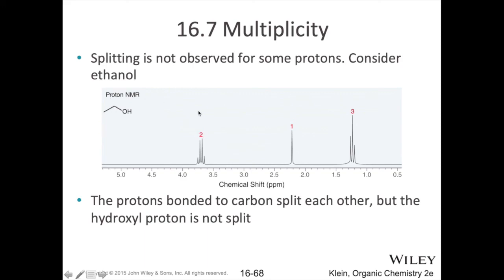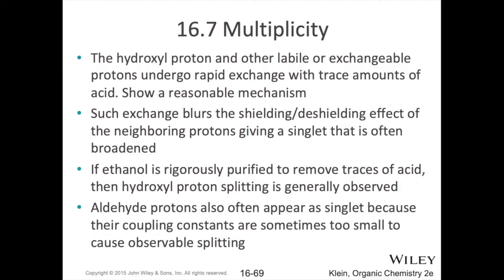So this is an interesting scenario with the alcohol protons, or hydroxyl protons, and this comes about from their intense hydrogen bonding, or rather more like their acidity, actually, I guess.